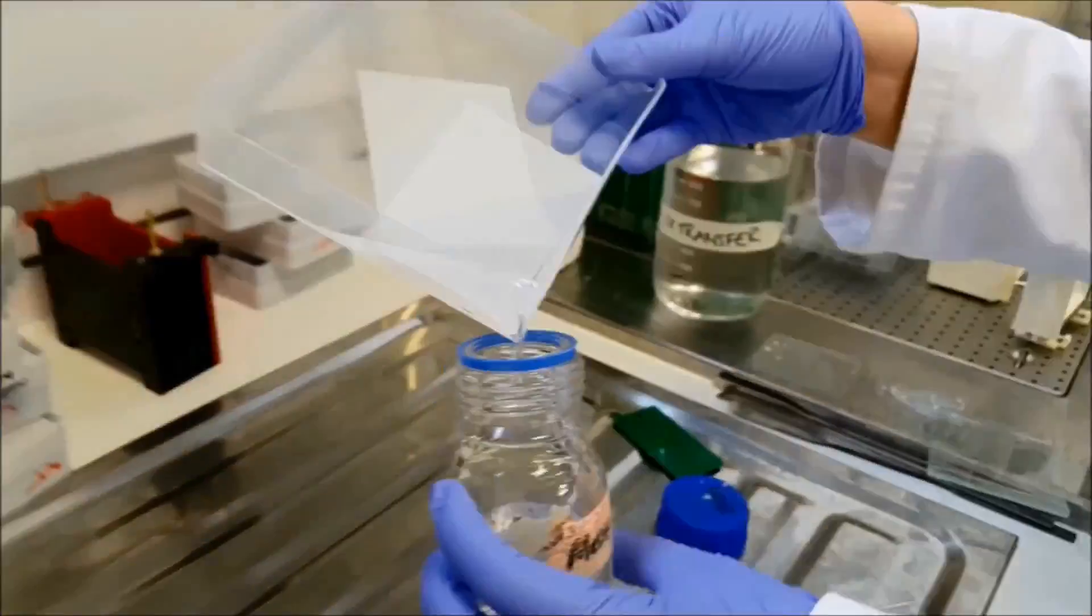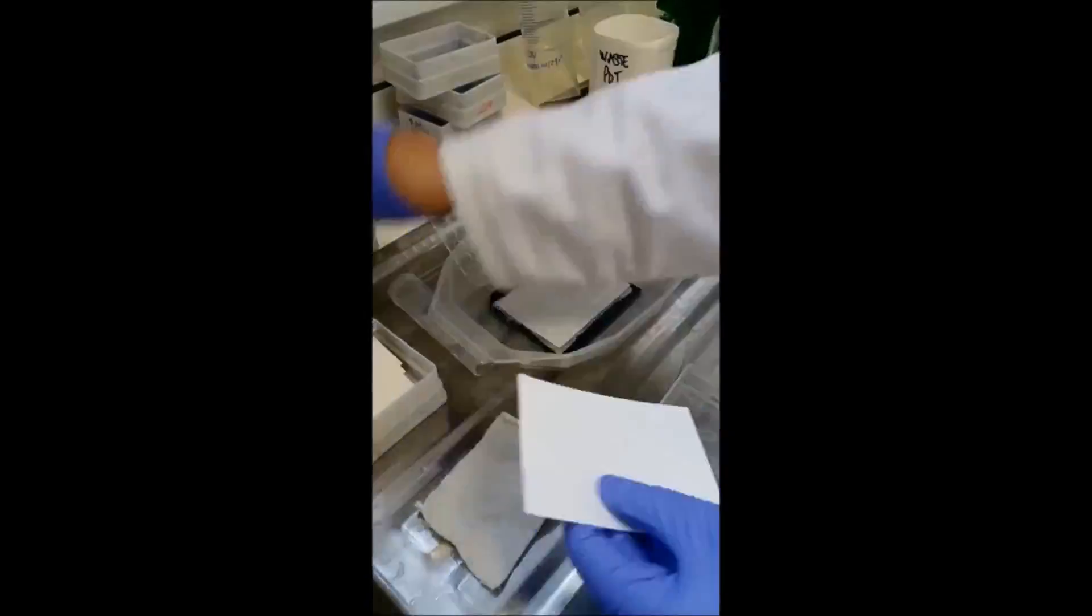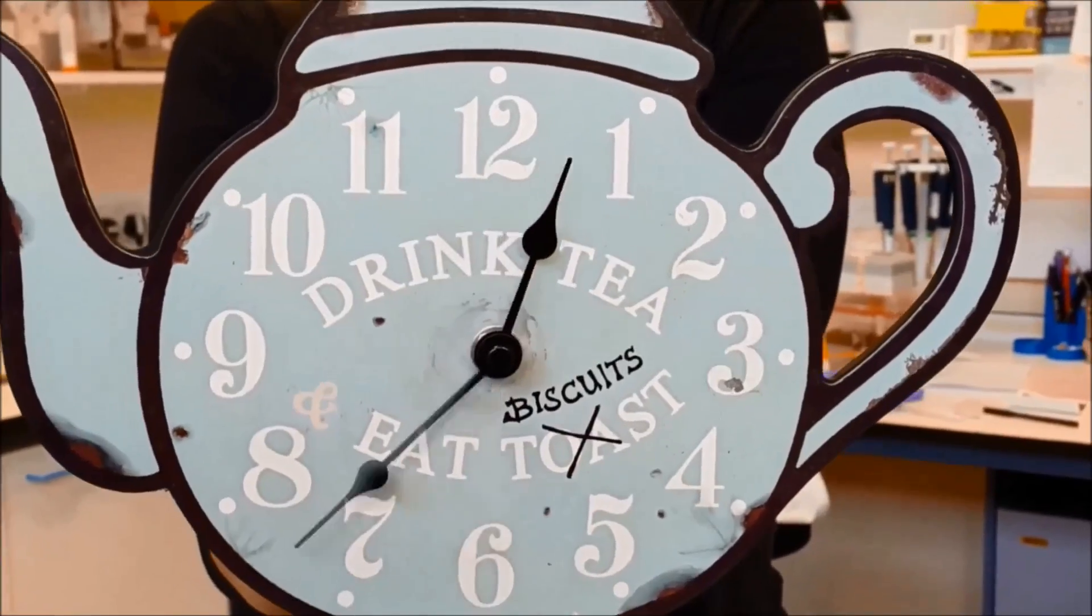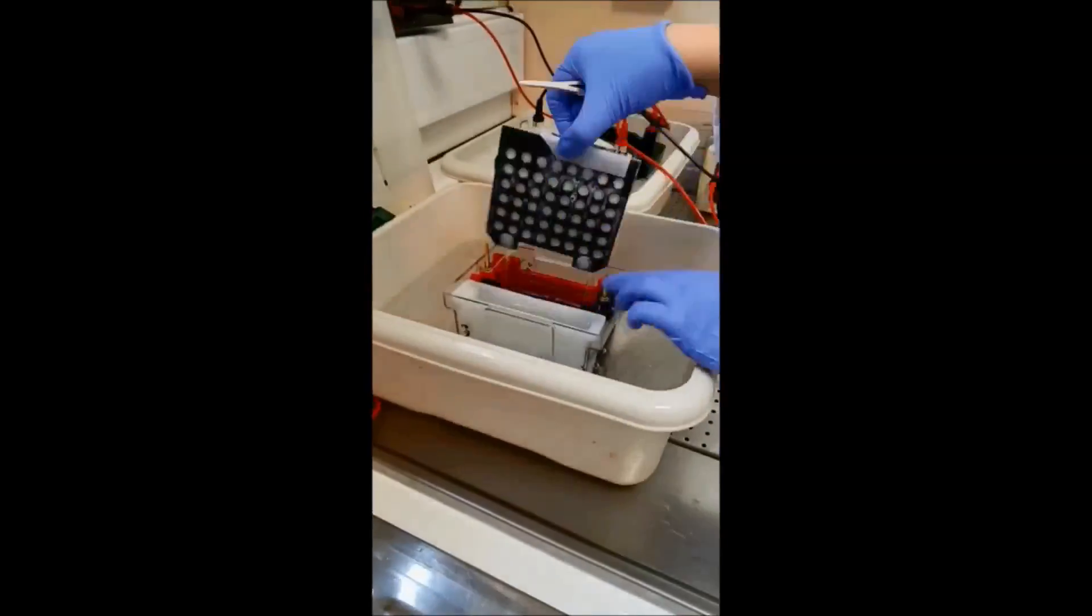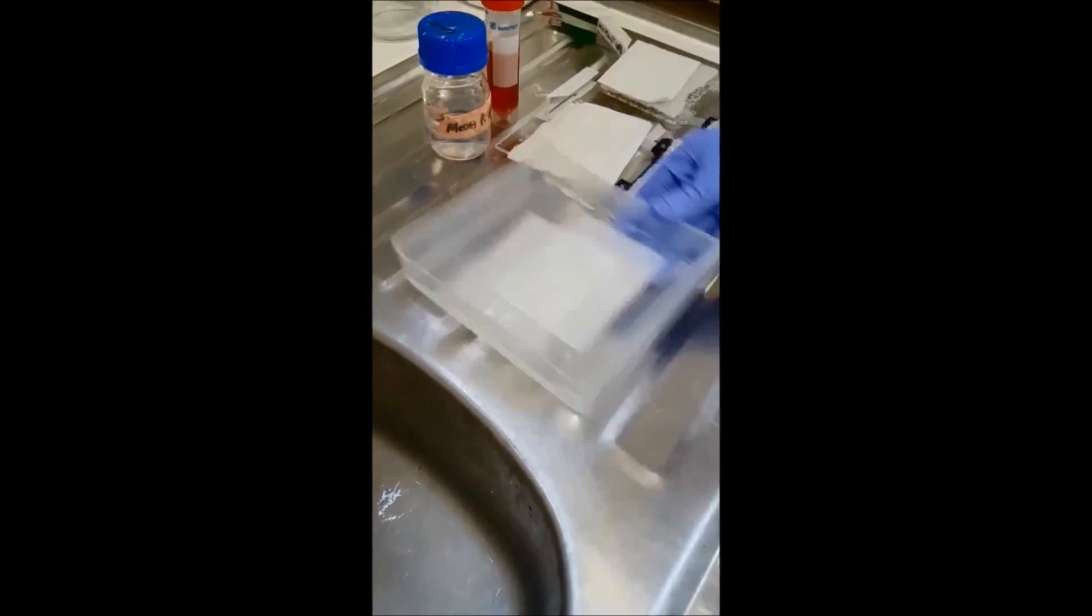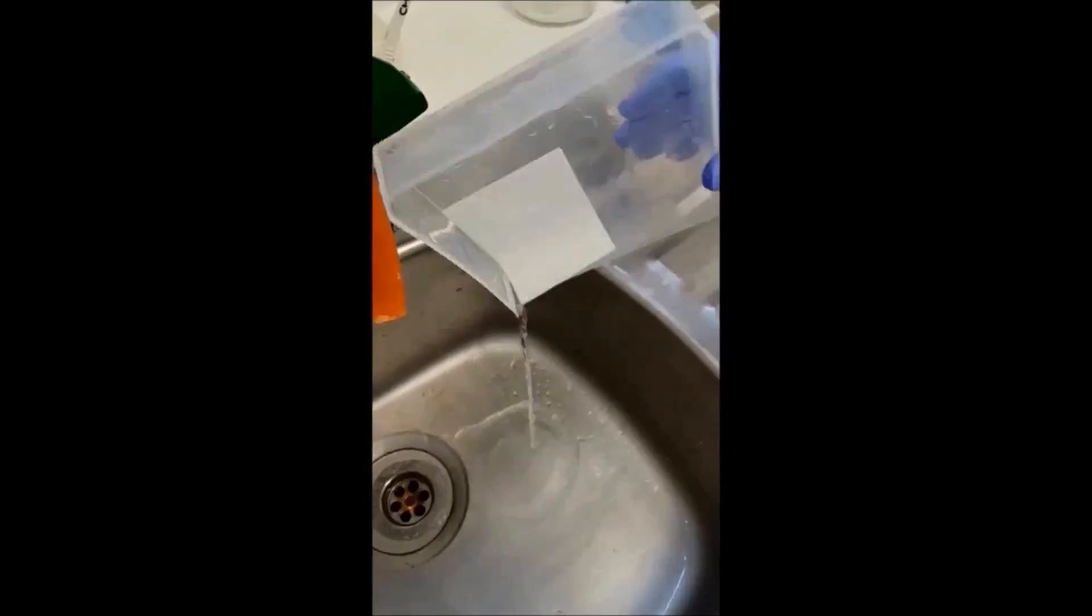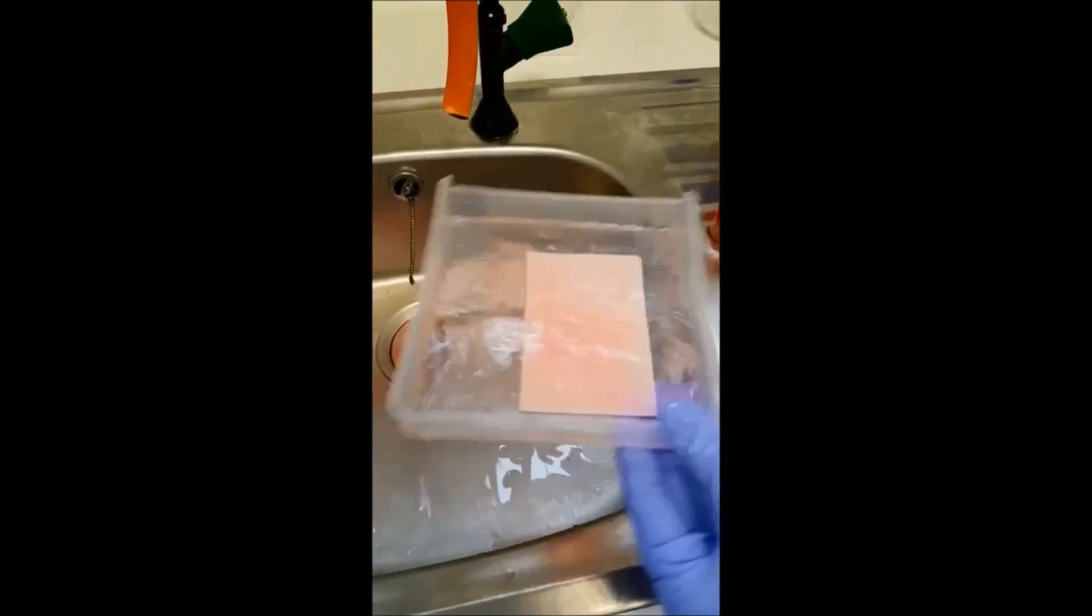The proteins are transferred onto a membrane again by passing an electric current through it. After a few hours, the protein is transferred from the gel onto a membrane. We then add a red dye so that we can see it and check that it has transferred properly. The red dye is then washed off, and the membrane is ready for the next step.